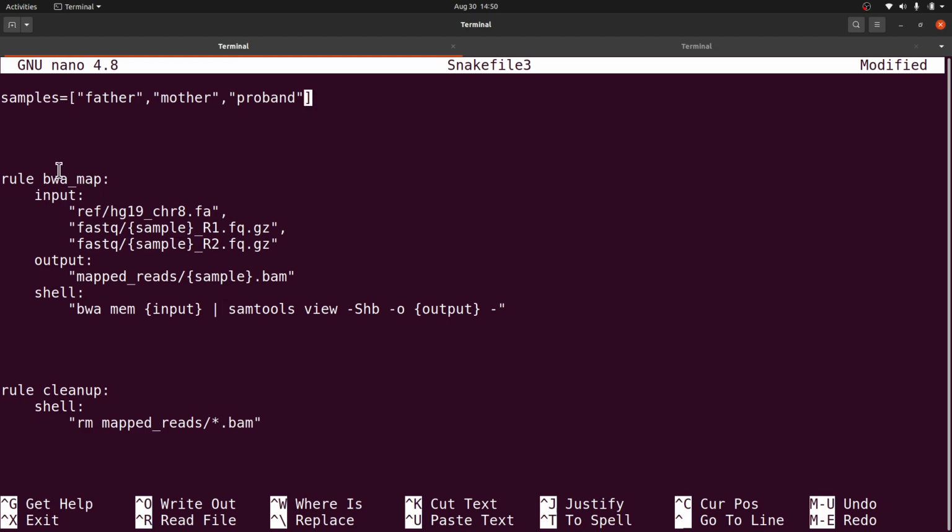What we have here was called run in principle. But with Snakemake, what happens is that it tries to infer, or it tries to get all the information it needs based on what you have supplied. So you realize that when we were calling Snakemake, we only specified the output file, and then it automatically did its maths and got the input files based on the information you have supplied in the script, when we were about to run it.